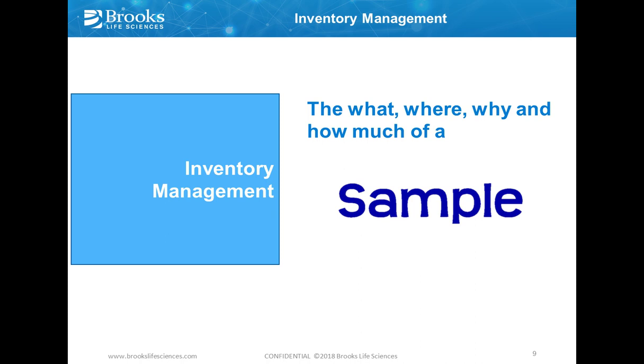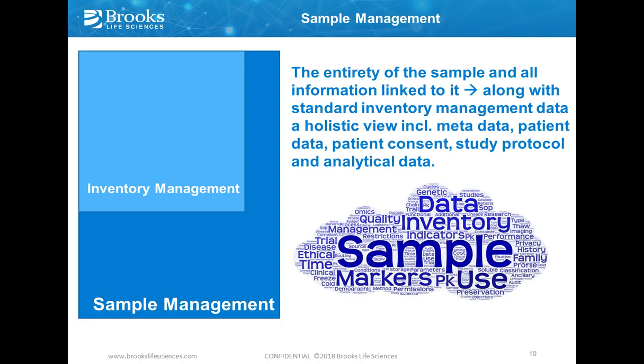Where is the material stored? As I mentioned previously, you can have lots of different parties involved in a trial, and the samples from a single participant can be spread across multiple locations. Why you have it is really about the intended purpose, and then of course you need to know how much of it you have for your future use.